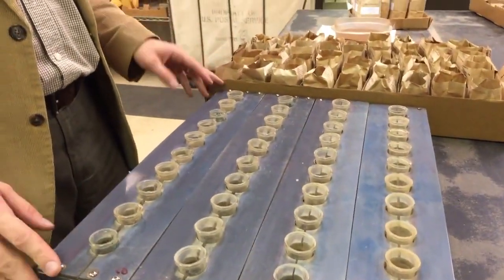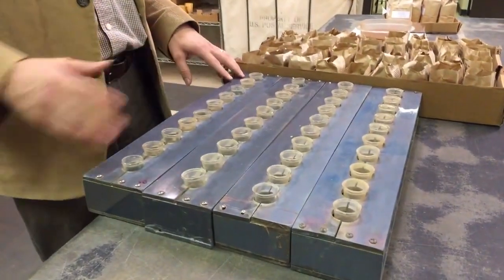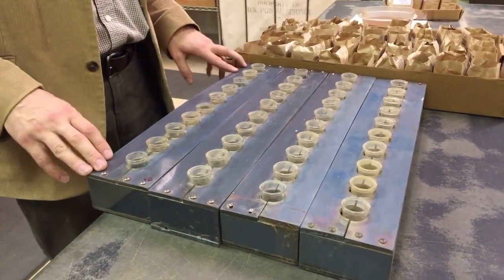On a slow day, we might do around 150 samples in one day, and when we get really busy, we can do up to 1,500 in a day. These racks really help us streamline that process and keep everything organized so that we don't get a sample mixed up.